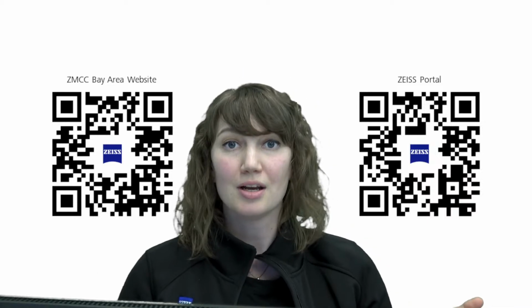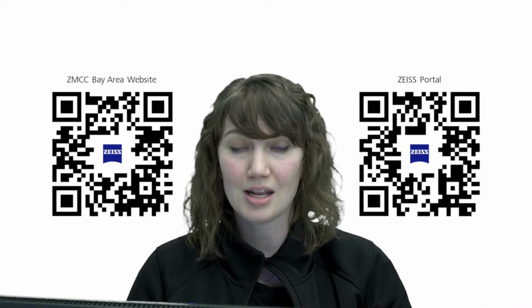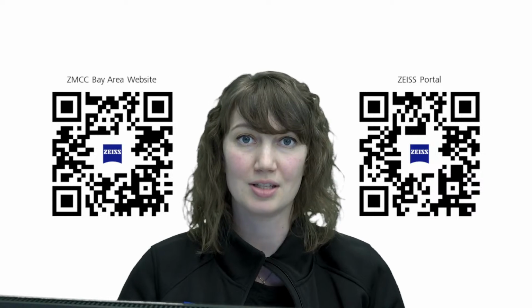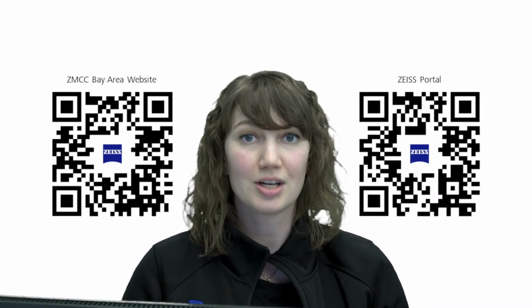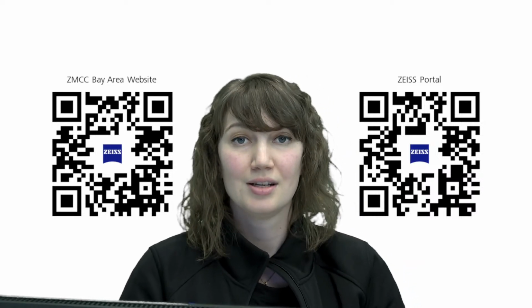All right, so that is how easy it is to use Dynamics Profiler. We used that on the LSM-900, which is really nice because typically if you are doing FCS, you would need to invest in the LSM-980, but any of the new systems that have the Airyscan detector, you can get that upgrade on. So 900 or 980, they're both options. And with that, if anybody watching has any questions, I would absolutely love to answer them. You can just put them in the chat.